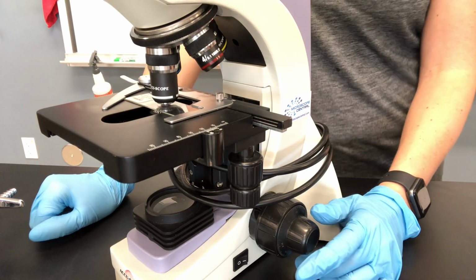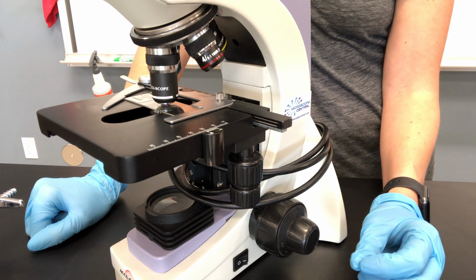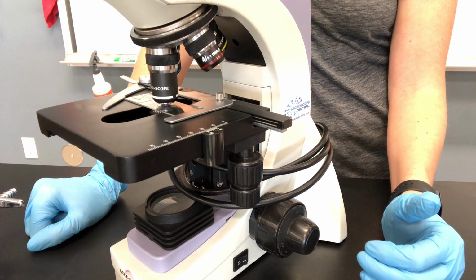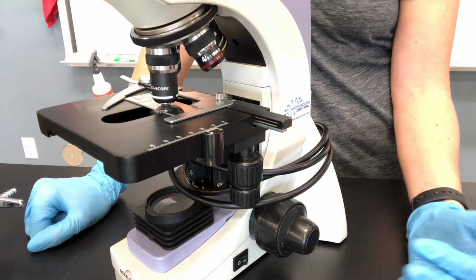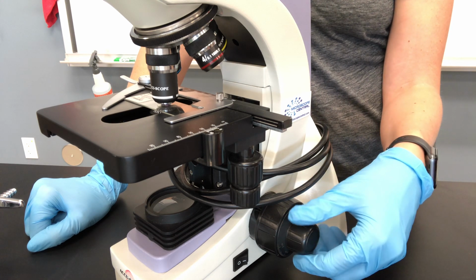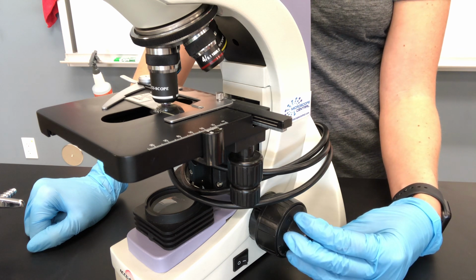to focus. Now it can be a little bit tricky, so I always encourage students, don't just start cranking on that fine focus knob to try to find what you're looking for, because then you might, what we call losing it. It's still on the slide, but it may not be in focus. So pick a direction. I usually go away from me first. So like 1, 2, 3, full turns on that fine focus.